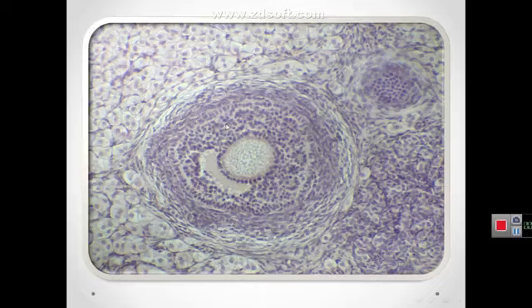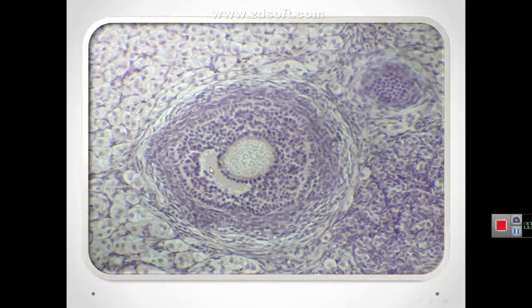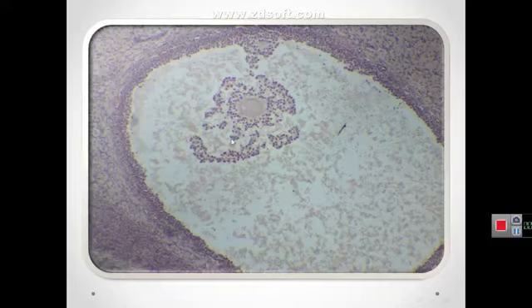The secondary or antral follicle contains the oocyte, zona pellucida, granulosa cells, antrum, theca interna, and theca externa. This is the oocyte of a graafian follicle with a single large antrum.